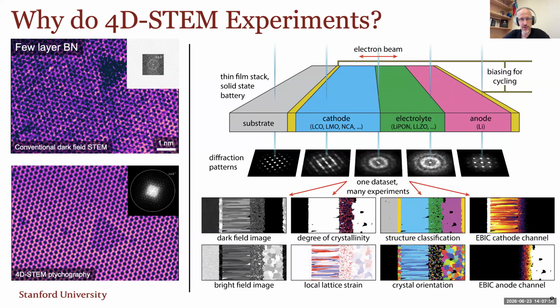And then once you have that large data set of diffraction patterns, you could do virtual imaging, measure crystallinity, strain, classify structures, crystal orientation, or even more exotic channels here. So today, I'm actually not going to talk about a lot of the 4D STEM nanobeam processing, partly because we previously used a lot of classic image processing, and currently we're working on several machine learning versions of these codes, and they should be ready for release by about this time next year for the next summer school. So something to look forward to next year.